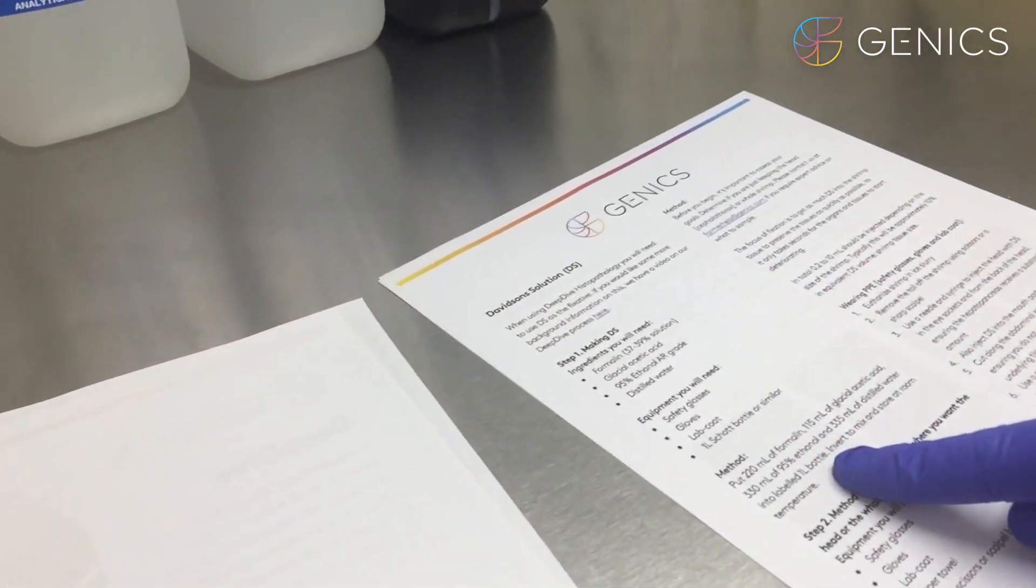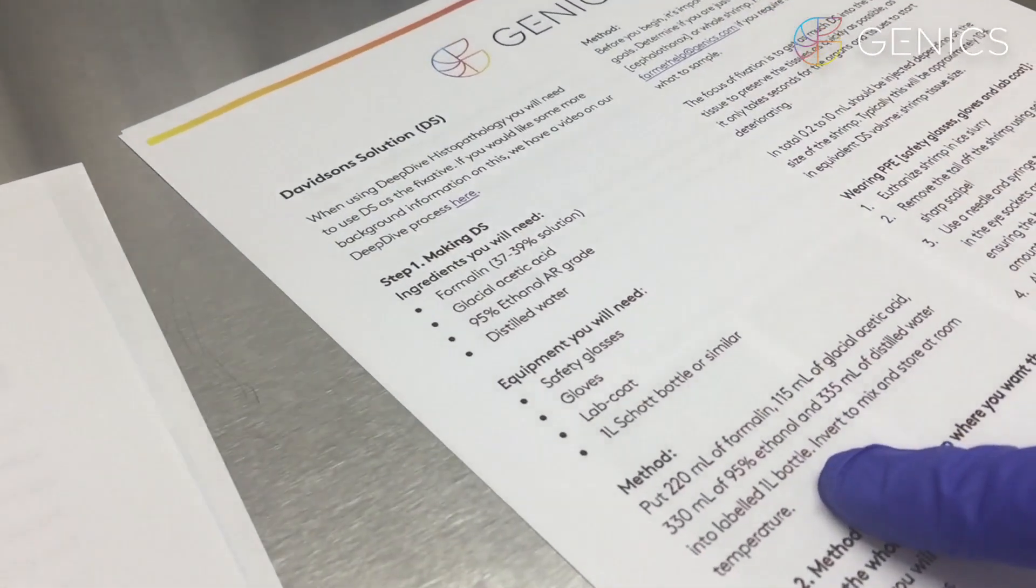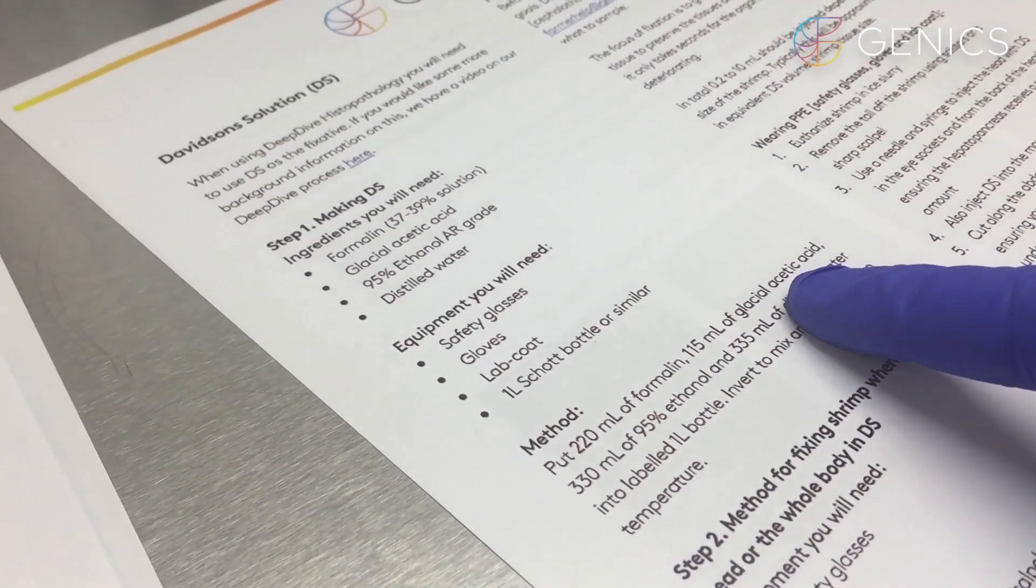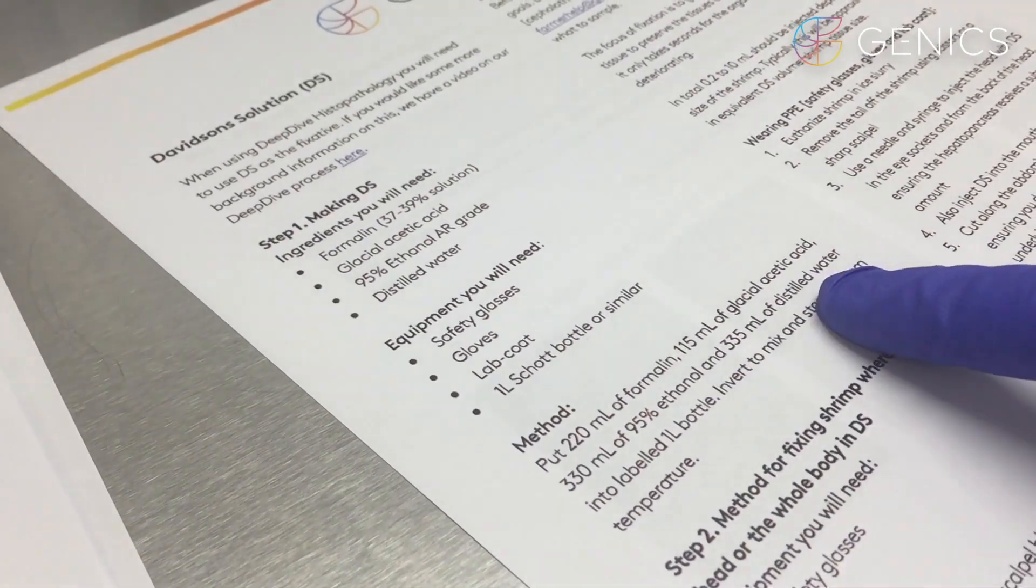So here in the deep dive brochure is the recipe for making up your Davidson solution consisting of formalin, glacial acetic acid, ethanol and distilled water.